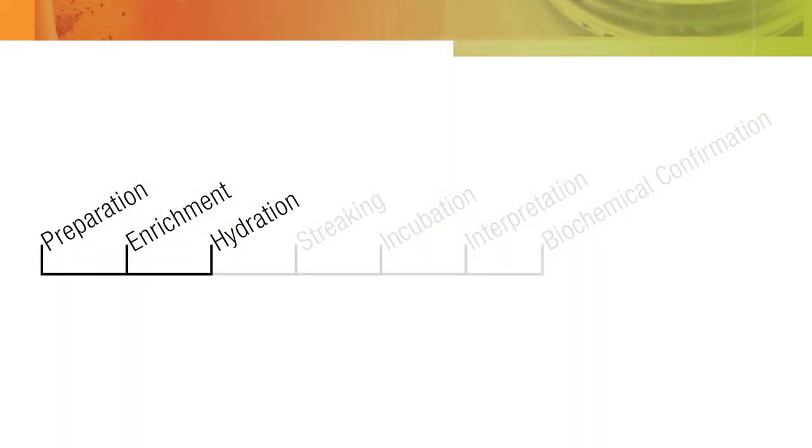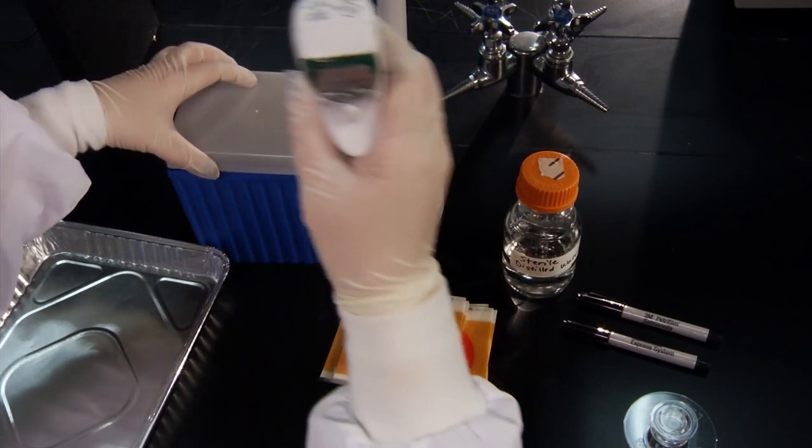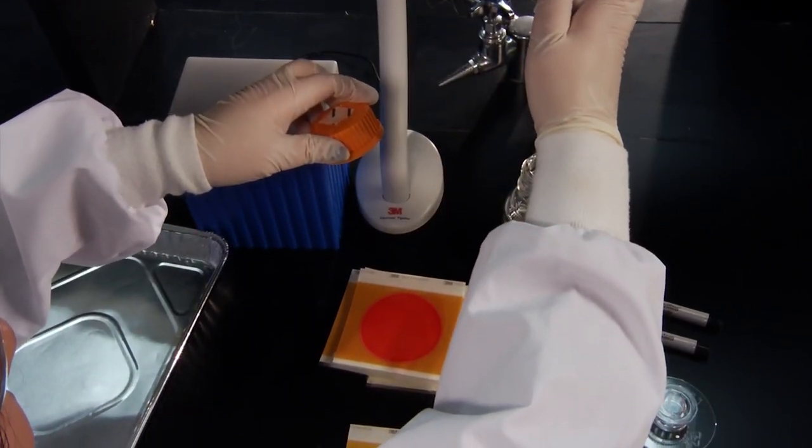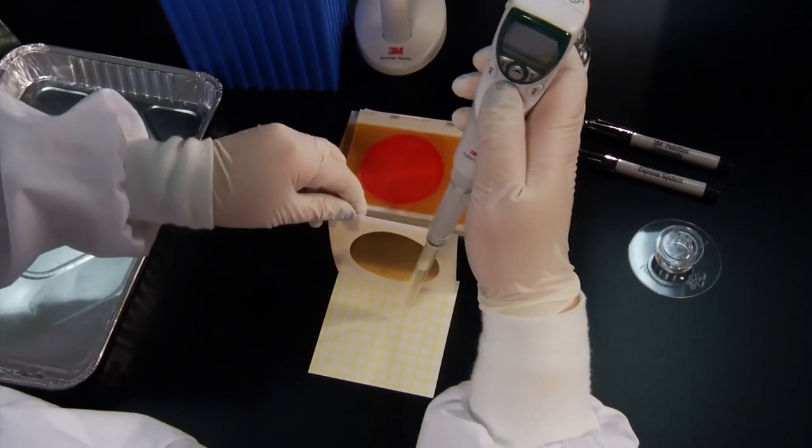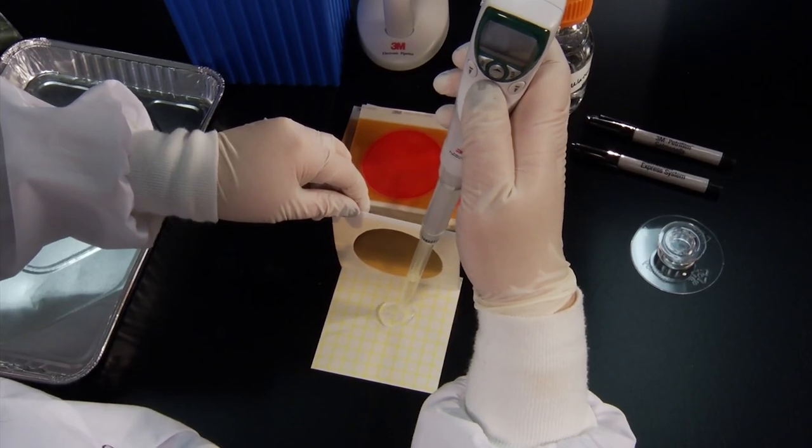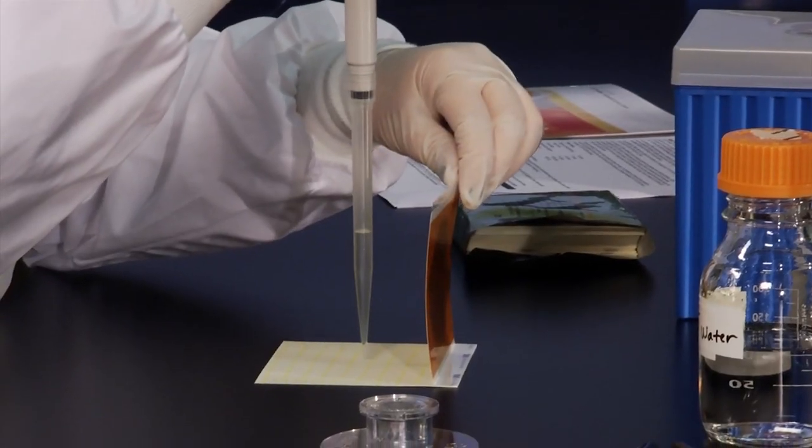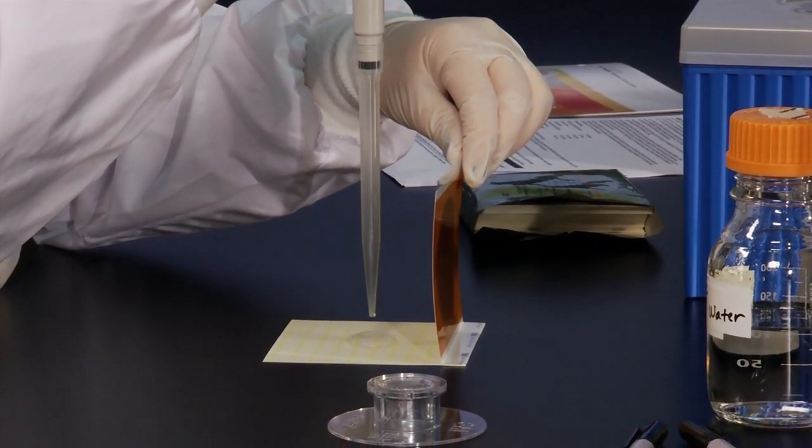The next step is the hydration procedure. To hydrate the 3M PetriFilm Salmonella Express Plate, place it on a flat level surface. Lift the top film and with the pipette held vertically, dispense 2.0 milliliters of the prescribed sterile diluent onto the center of the bottom film. Do not close the top film before dispensing the entire 2.0 milliliter volume.